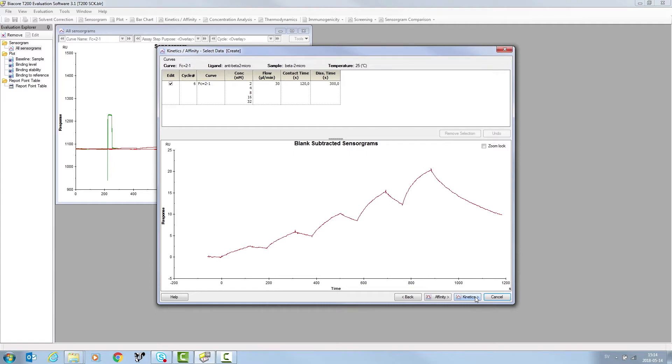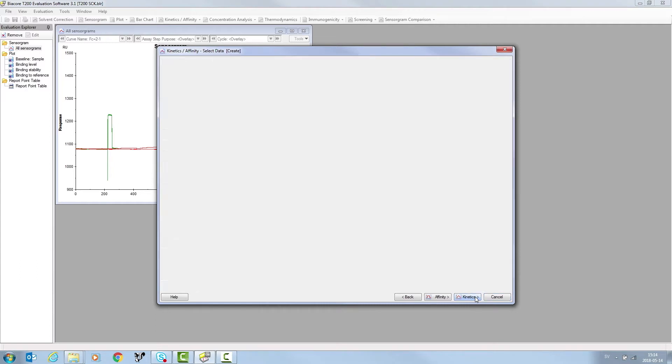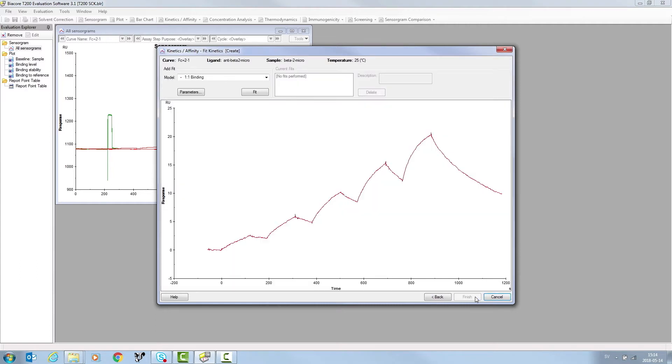Click Kinetics to characterize the kinetic properties of the interaction, and select the Binding model. In this case, 1-to-1 binding is selected.